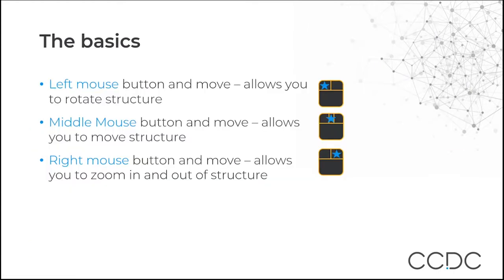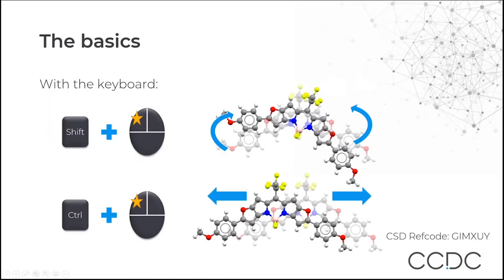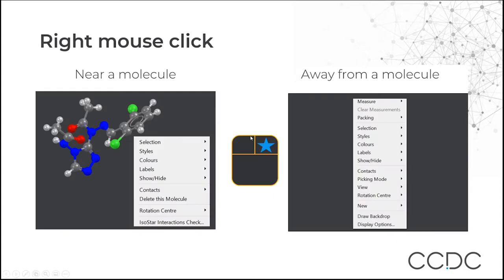The ref code is our database reference code, and structures with the same substance are assigned the same six-letter code plus an additional two numbers. If you want to navigate to a particular ref code, you can type it in the structure navigator box at the top right. Left mouse button and move allows you to rotate the structure. Middle mouse button and move allows you to move your structure. Right mouse button and move allows you to zoom in and out. You can also use the keyboard in combination with your mouse — shift and left mouse, or control and left mouse. Right-clicking near a molecule or away from a molecule gives different menu options to change display settings.